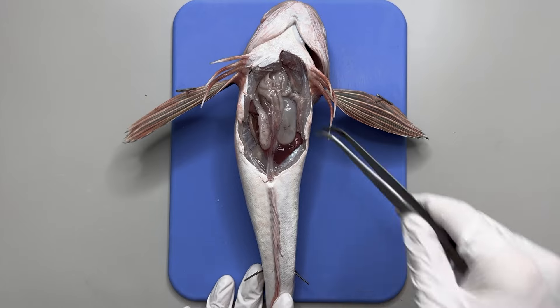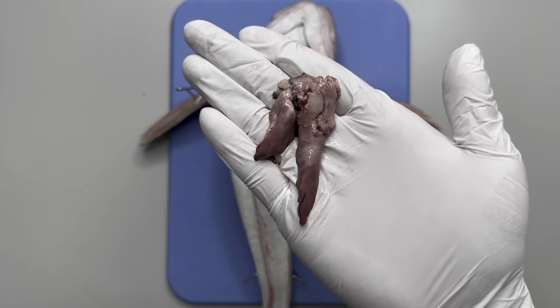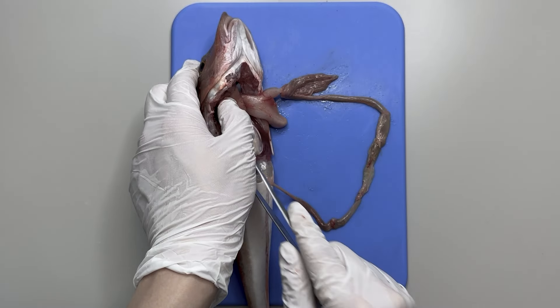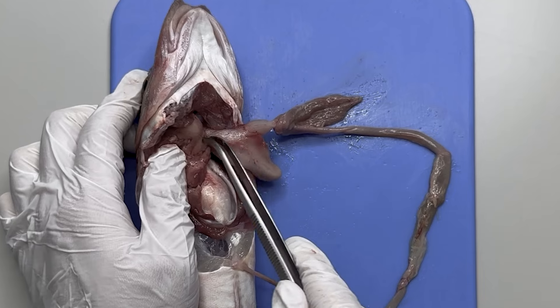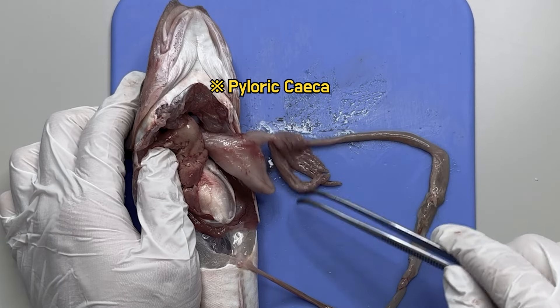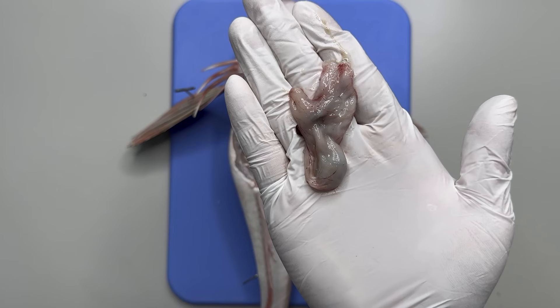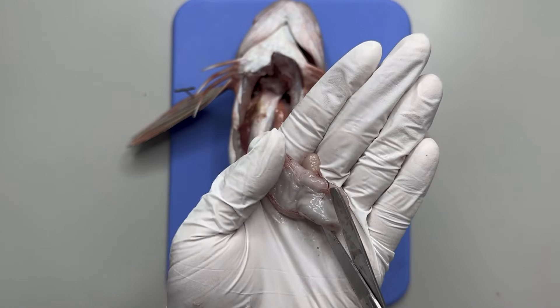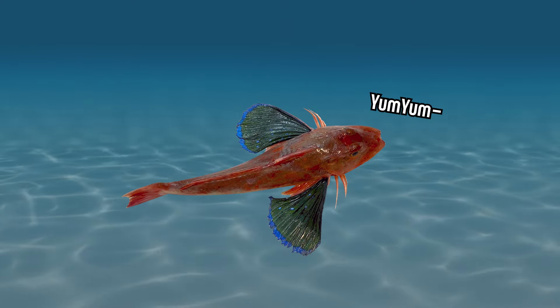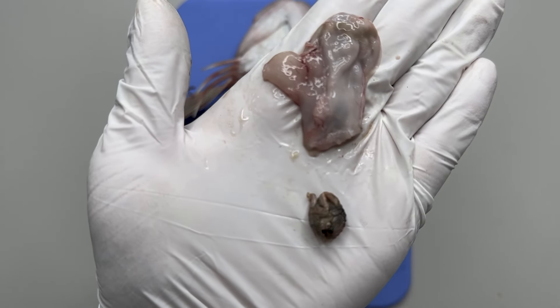This is what the inside of a gurnard looks like. At the very top is the liver. After removing the liver, I extracted and laid out the digestive tract. This part is the esophagus that connects to the mouth, and the section attached to the esophagus is the stomach. The section between the stomach and intestines is the pyloric ceca, and the intestine stretches all the way to the anus. Isolating and slicing open the stomach, there's something inside — upon cleaning, it turns out to be a small crab. Gurnard live by preying on crustaceans and polychaetes on the seafloor, hence the discovery of a small crab inside the stomach.